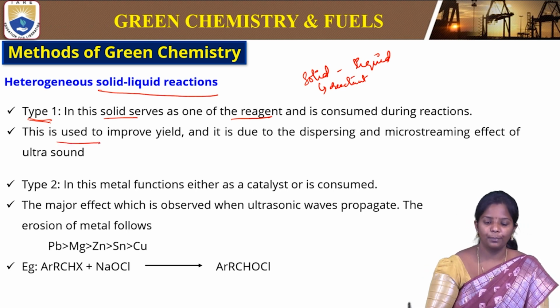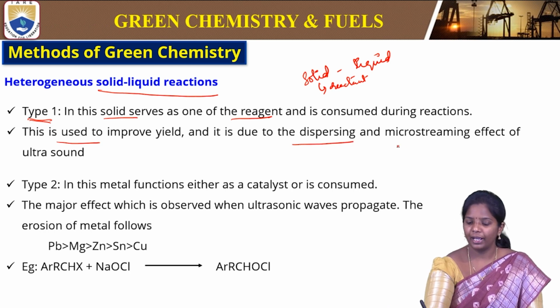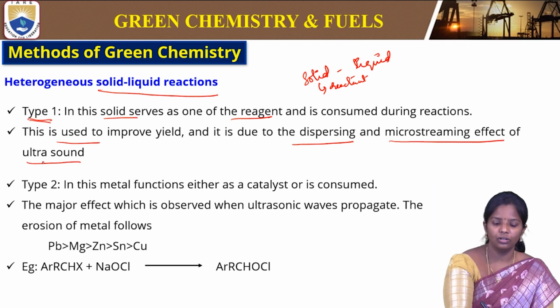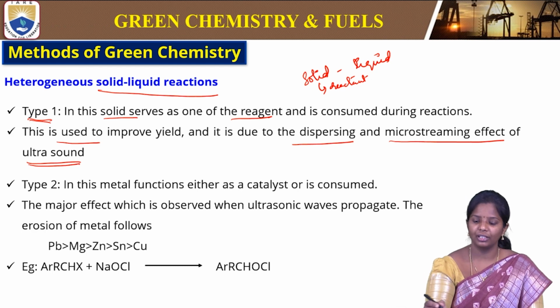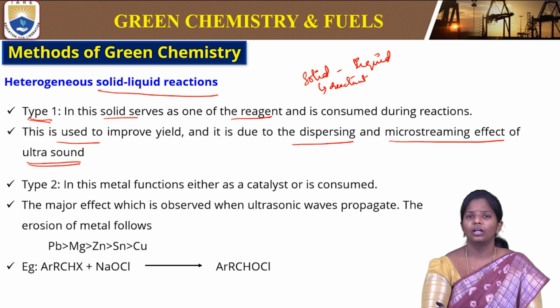This is used to improve the yield, and it is due to the dispersion and microstreaming effect of ultrasound. Ultrasound plays an important role in the dispersion and microstreaming of those reactants, giving rise to products, and so the solid is consumed during the reaction.